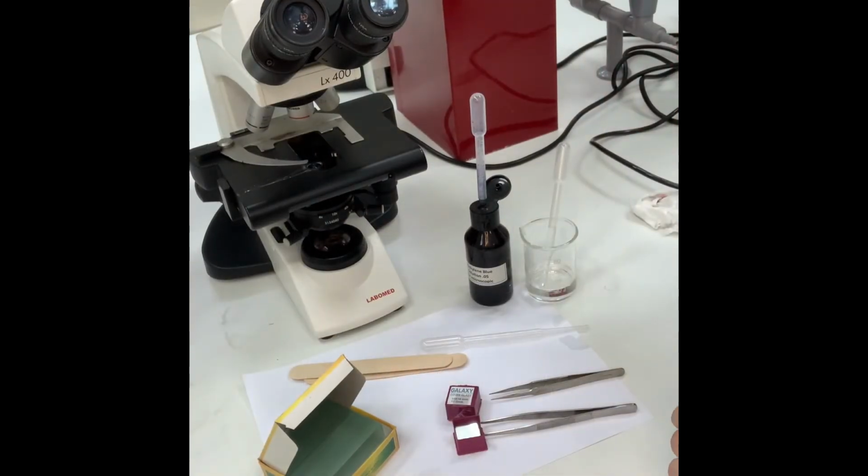Hi everyone. This practical experiment is about wet mount preparation. We need to prepare a microscopic slide to study cells. Now in our task we are preparing cheek cells and onion cells. Cheek cells are an example of animal cells, and onions, we're using onions as an example of plant cells.